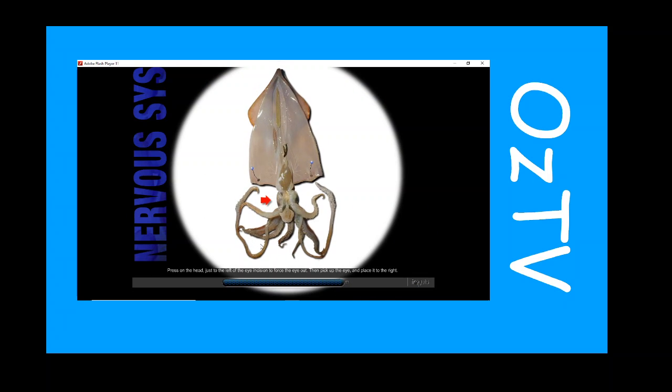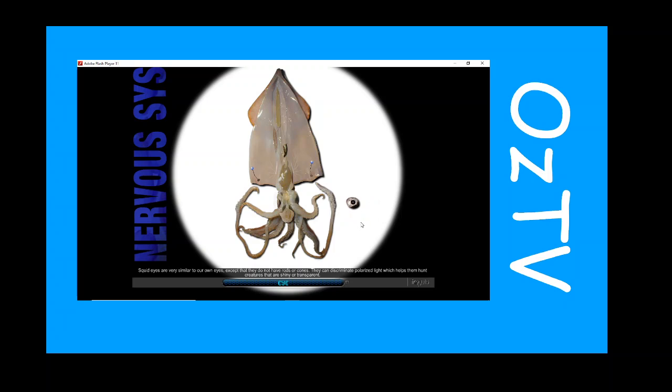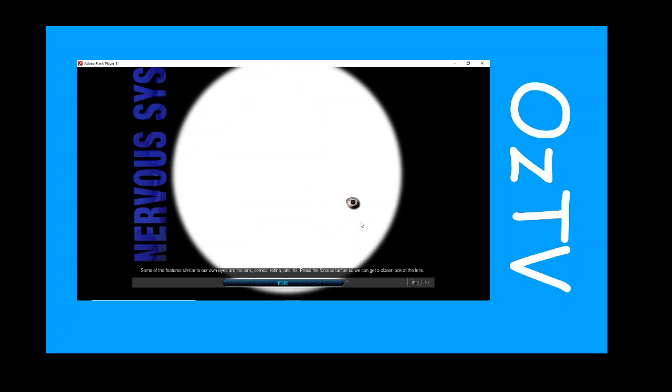Press on the head, just to the left of the eye incision, to force the eye out. Then pick up the eye and place it to the right. The squid eyes are very similar to our own eyes, except that they do not have rods or cones. They can discriminate polarized light, which helps them hunt creatures that are shiny or transparent. Some of the features similar to our own eyes are the lens, cornea, retina, and iris.